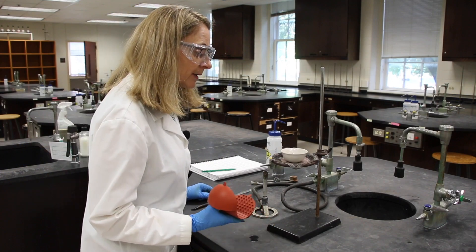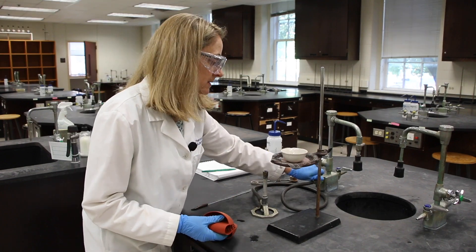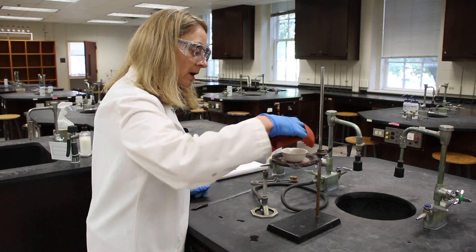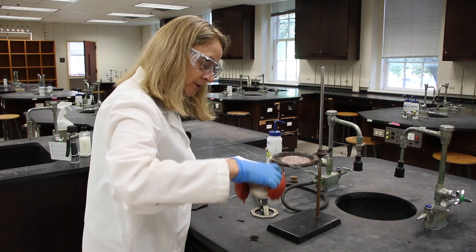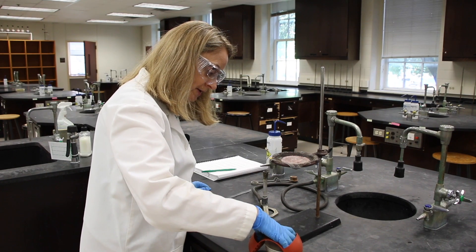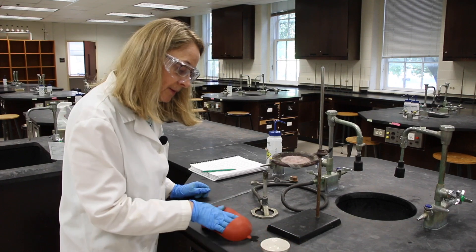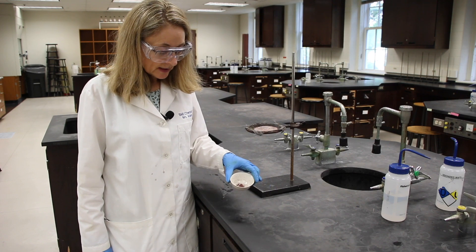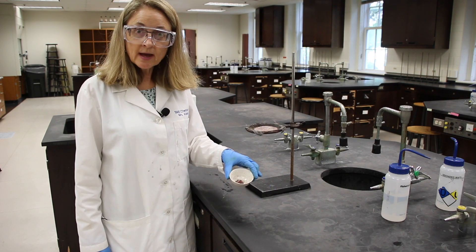Our copper sample appears to be dry. We can shut off the gas at the source, and then we'll use our hot mitt to remove our evaporating dish to the benchtop so it can cool. Now that our sample is completely cool, we can go re-weigh it at the balance.